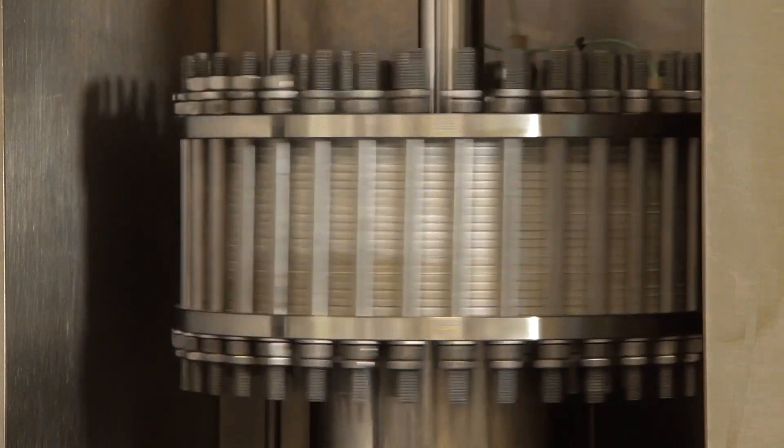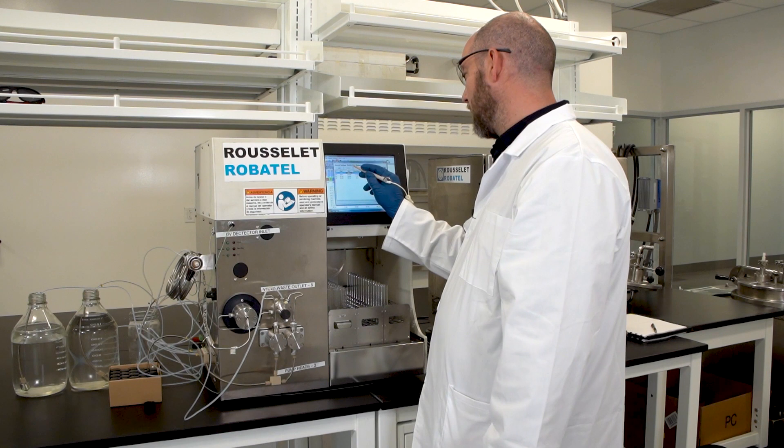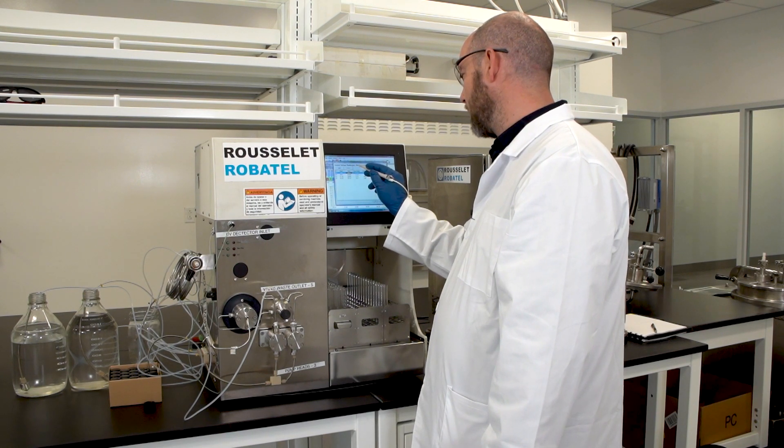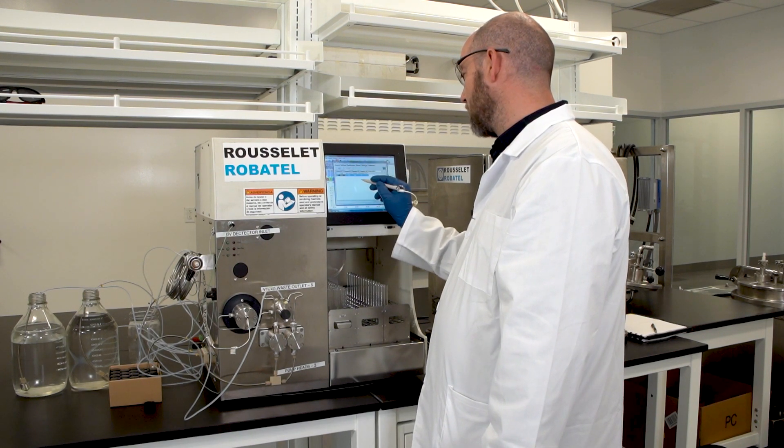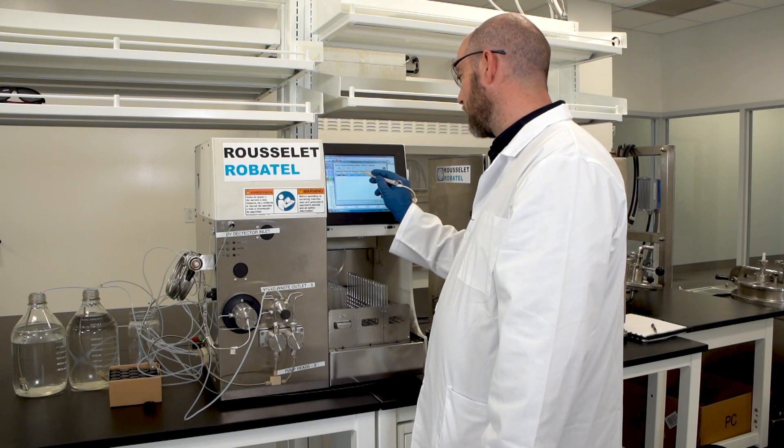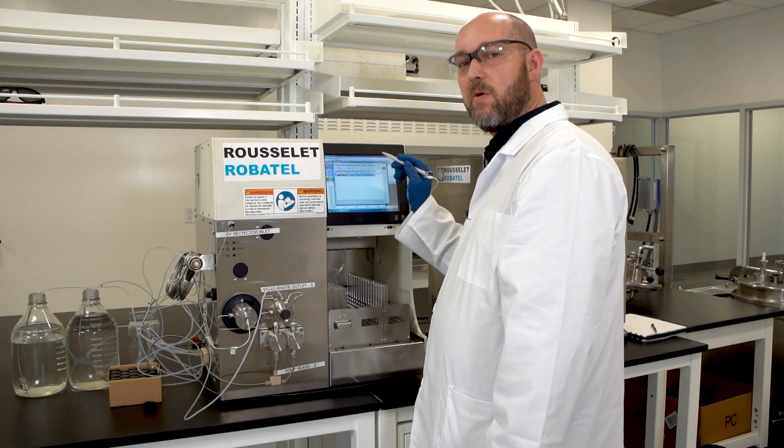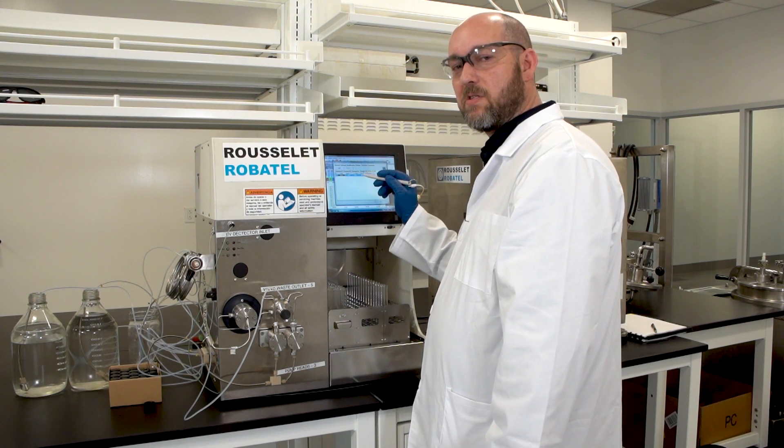So to start the system, I have my method already loaded. Just to briefly go over the method, you have an equilibration step. You have an elution step. You choose what wavelengths you're going to be detecting. I have mine set specifically to general cannabinoids and then one for specifically THC so that I know when THC has stopped eluting out of the system.